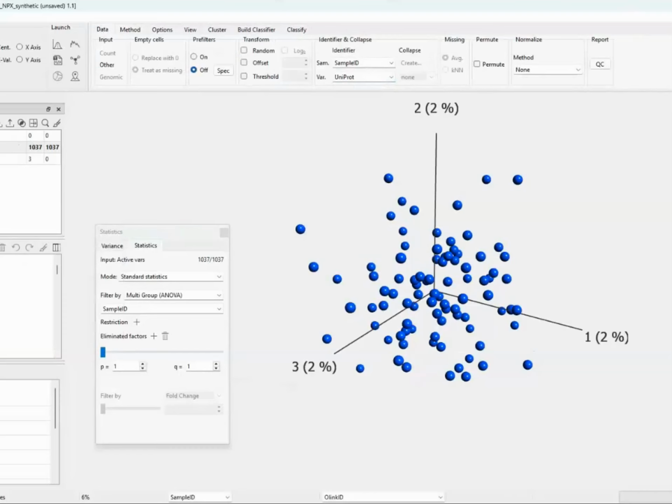Now, if I would like to remove control identifiers, I can do that also, and they are often available here also within the panels. And I will import here. Let's see if we can do that. I've prepared those that are control variables here in a small file.